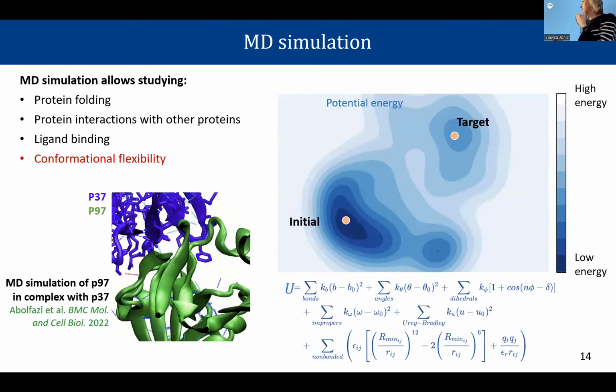And what you have, as you correctly pointed out, is an initial state here. And let's say you want to go to the target state. Again, at this point there are no data; we are speaking about simulation. You have one atomic structure, and based on these statistical mechanics equations you want to explore and find all the states around.